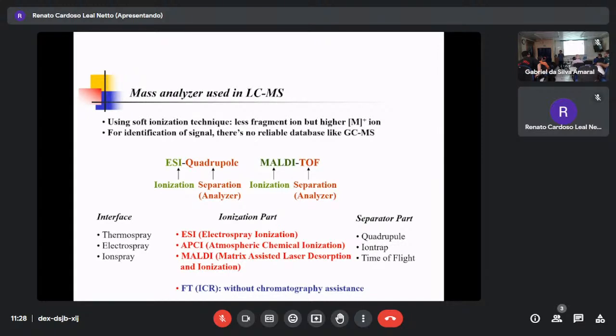It really depends. In lipidomics, instead of plants, we are using it more in inflammation studies, in clinical studies, right? Then with APCI, of course, more is better. And you also mentioned ion mobility yesterday, right? In these cases, ion mobility is sometimes helpful for lipidomics.